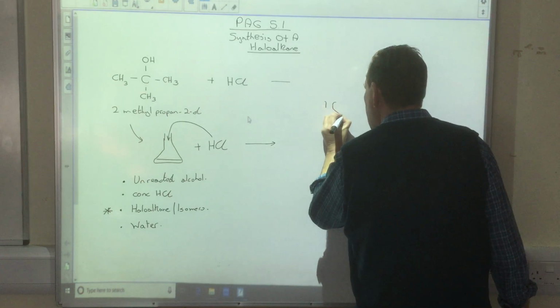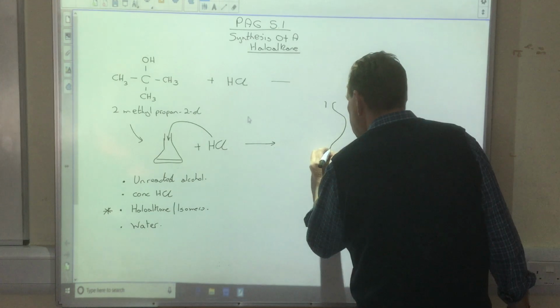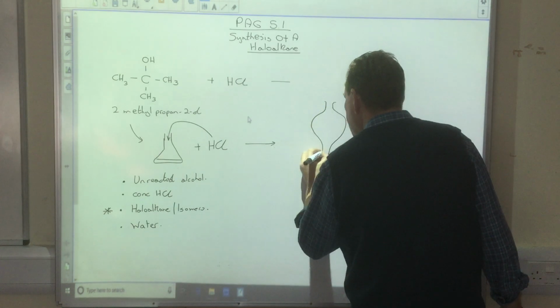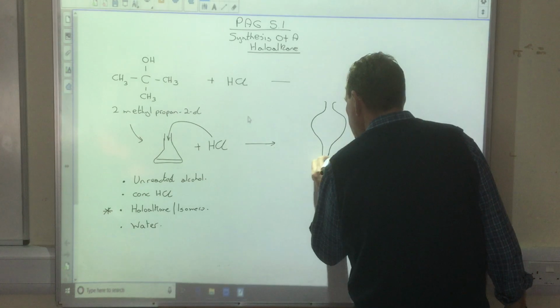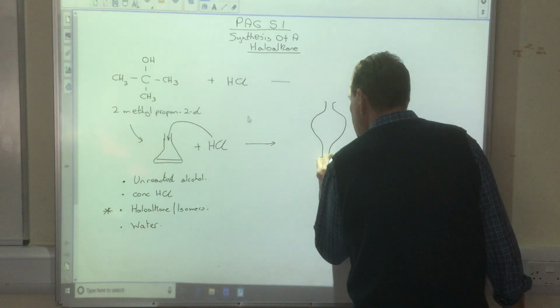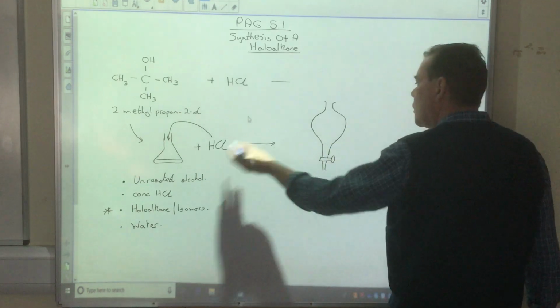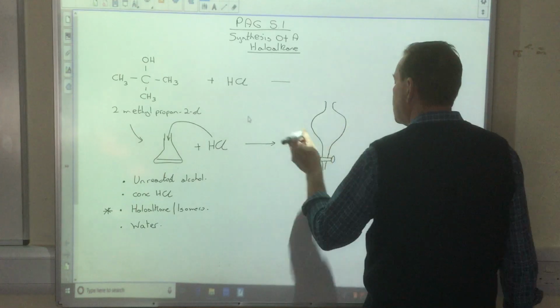We've got them here, but I can't quite access them at the moment, and they look like that. They can clamp, and they've got a tap at the bottom like that. They are for separating mixtures without the faff of distillation, which can cause problems because you're heating things up. So in it all goes into a separating funnel.